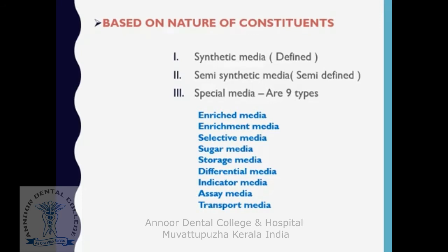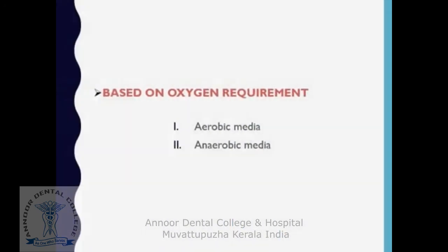There are about 9 types of special media, which is denoted as enriched media, enrichment media, selective media, sugar media, storage media, differential media, indicator media, assay media, and transport media. A variety of 9 different types of special media are available. The fourth classification is based on oxygen requirement, aerobic media and anaerobic media.